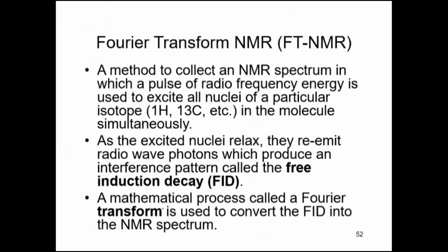In FT-IR we have studied how all the electromagnetic radiation of different frequencies is simultaneously bombarded, and it gives you a somewhat complicated pattern of electromagnetic radiation which consists of all the wavelengths, the combination of all the frequencies. You must be remembering that decay signal.